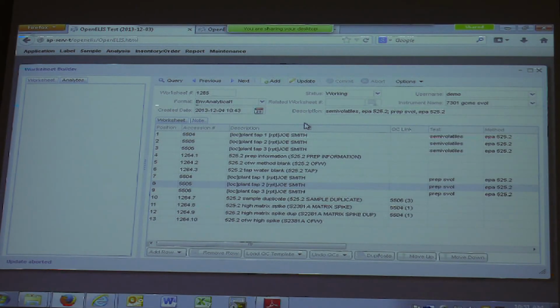Where did that come from? Yeah, this one is going to screw people off. That's a month.